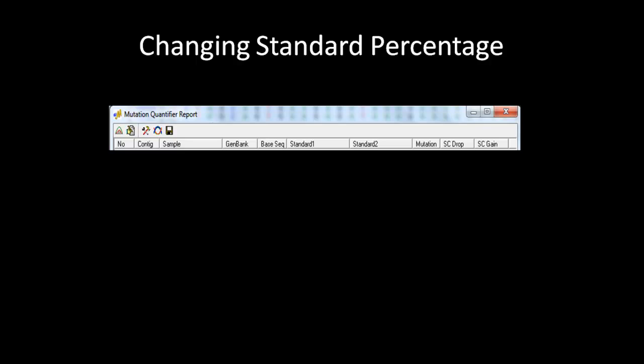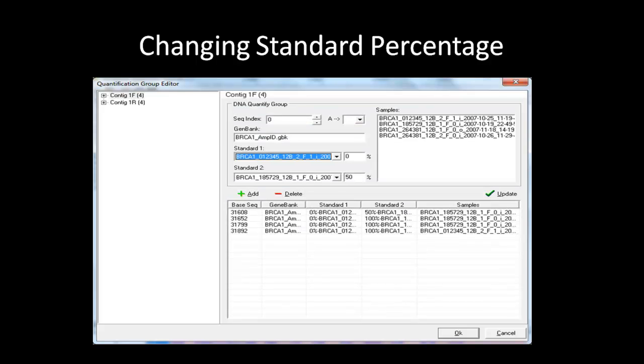This is the toolbar of the quantification report that you will see after hitting OK in the dialog box. To change standard 2 percentage from 100% to 50% for a heterozygous variation, click on the Edit Groups icon. This will bring up a separate dialog box. You will select your standards here like before, but will change the percentage of standard 2 to 50% and leave standard 1 at 0%. Then click on the Update button to refresh the quantification. Hit OK to exit out of this dialog box and go back to the main quantification table.